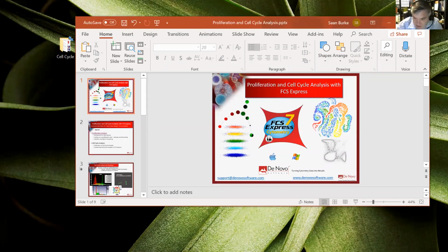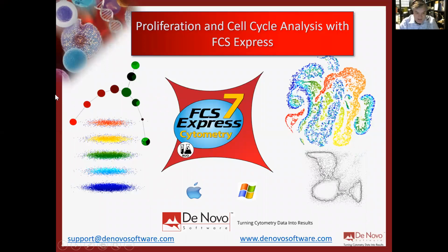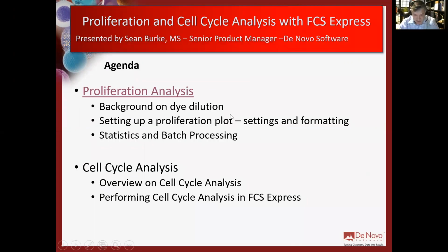All right, perfect. Thanks for having me in for session number 4 today to talk about proliferation and cell cycle analysis with FCS Express. Like the other sessions, I'm going to make this a practical approach for performing proliferation analysis. We'll go over that first, with a very brief background on the theory, and then jump into setting up some proliferation analysis in the software.